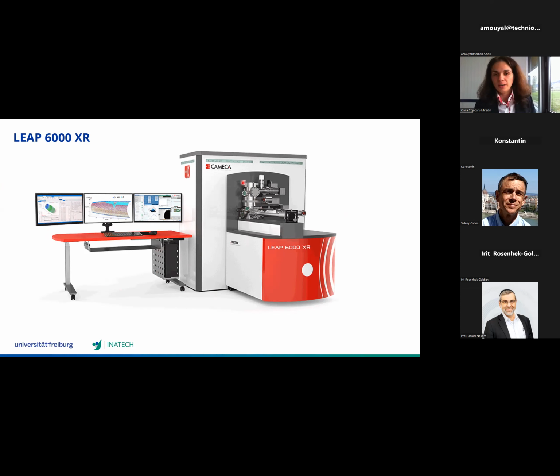And we see that we have three main chambers. We have the load lock, where we insert the sample inside the atom probe, the storage chamber, the buffer chamber, where we store our samples, and we can store up to 35 samples. And we have here in this white box the main chamber with the laser, where the experiments are conducted.